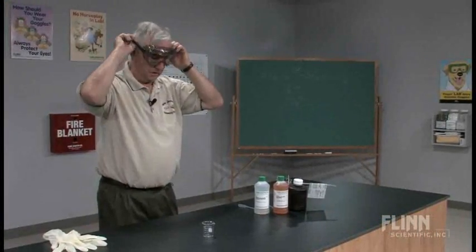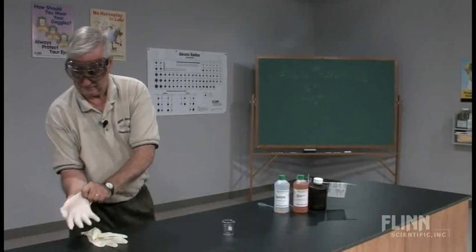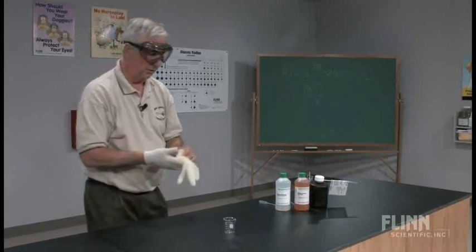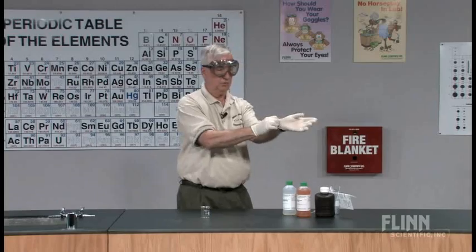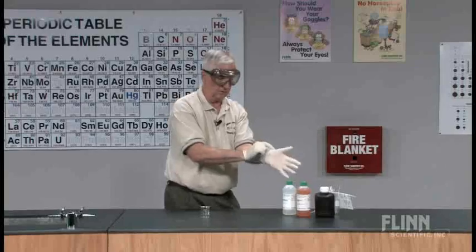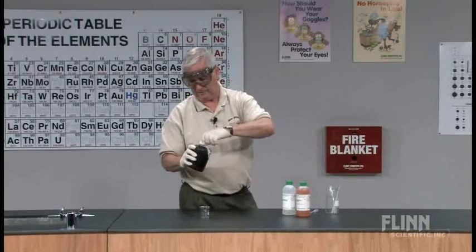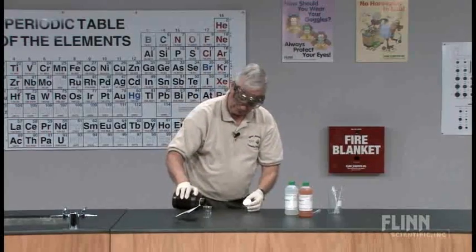Put on some goggles and some gloves. We're going to start with 30% hydrogen peroxide simply because we get a good reaction from it that is very visible. The 30% peroxide is going to be put into this beaker.